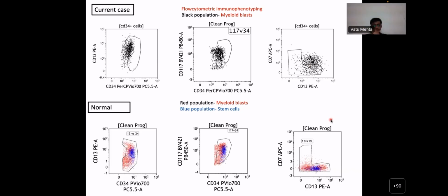Abnormal, ma'am. Okay. Now, these are abnormal myeloid blasts, but one thing was that in morphology we had seen 18% blasts plus promonocytes, whereas in this, I would like to inform that the blasts were just 0.6% abnormal myeloid blasts. Why would this be happening? Any reasons you could think of? Anyone else would like to attempt this question?